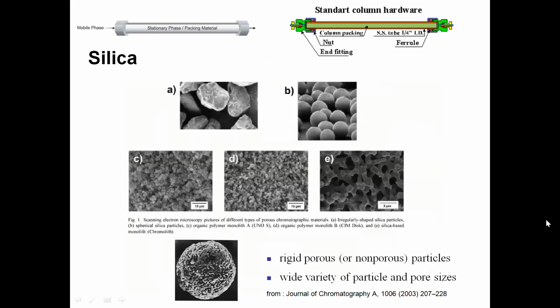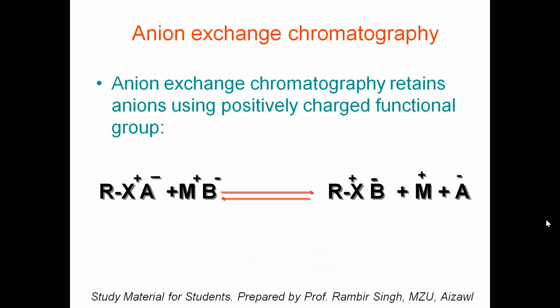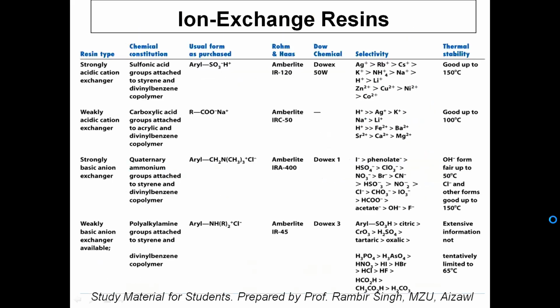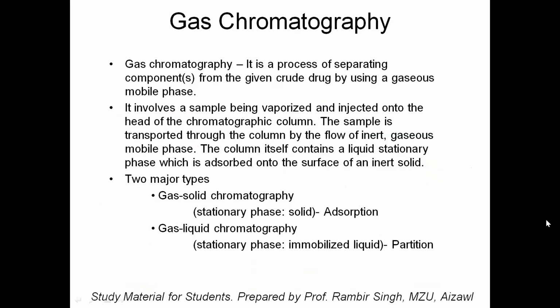So I think you can read these, and in case you have any issue, just let me know. And this is because you have the gas chromatography. I just want to discuss for a while with you about the gas chromatography. In gas chromatography, the mobile phase is gas.